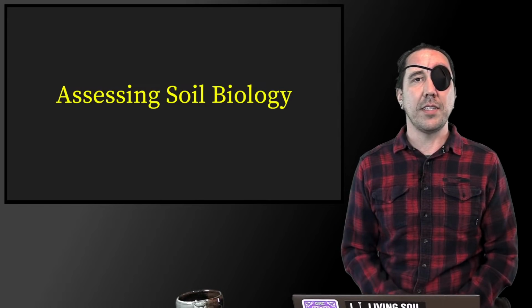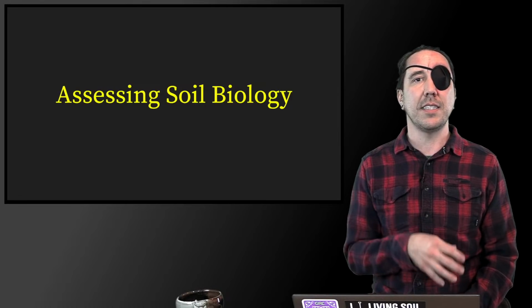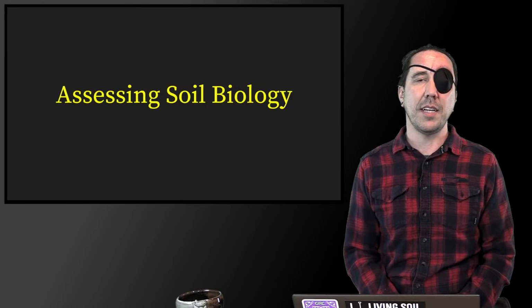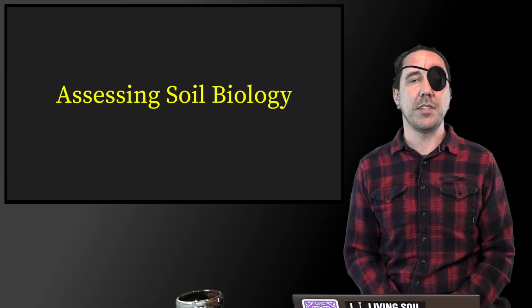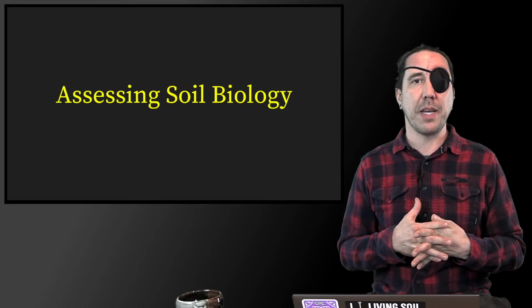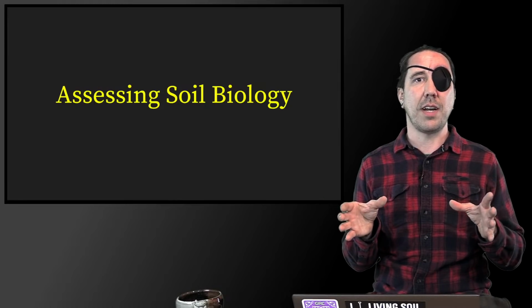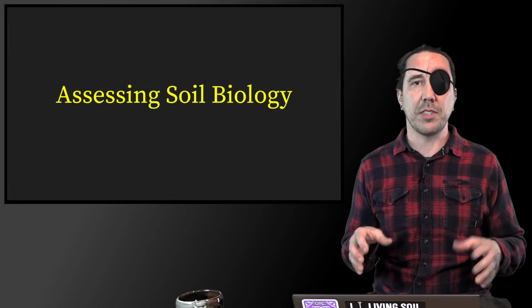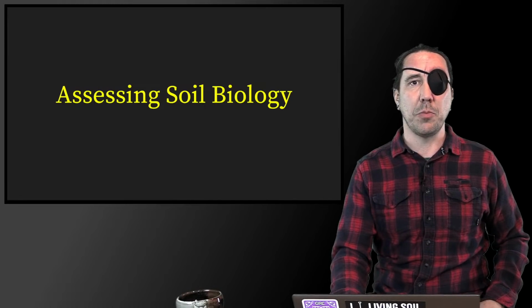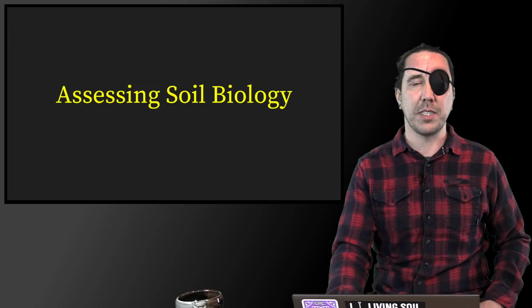Anyway, this class is basing information off of Meredith Lee's class a few years ago. She had done an assessing soil biology class, so I'm going to assume that most people watching this have a knowledge of soil food web characters, and we're going to take those characters and you're going to learn how to identify them with a microscope and use your microscope to look for them and see how your soil or compost teas are doing.